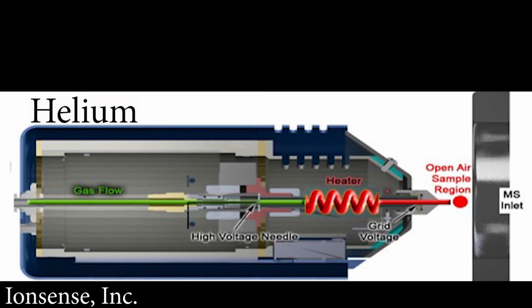DART has nothing to do with the science, so I will apologize that you have to memorize the term DART when it has nothing to do with the science. You could call any ambient ionization technique direct analysis in real time. But anyhow, it is a very good technique, and it's closest to APCI.